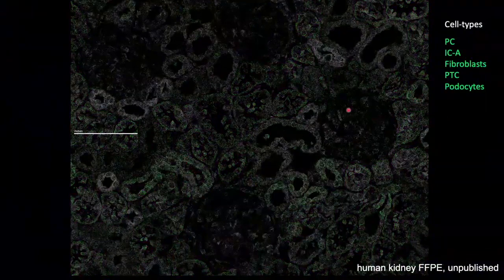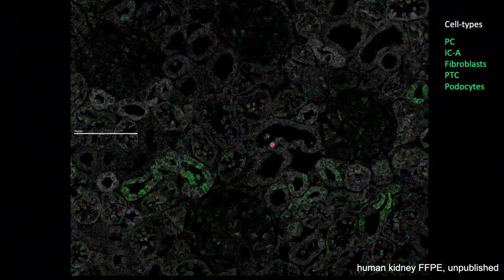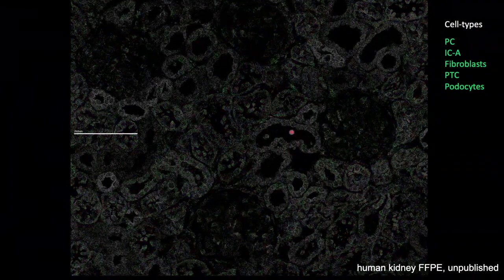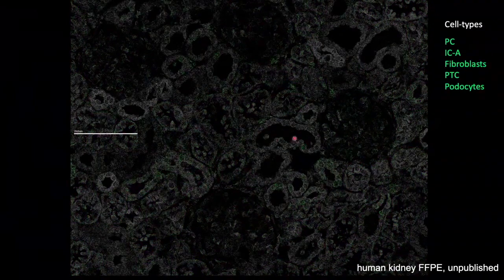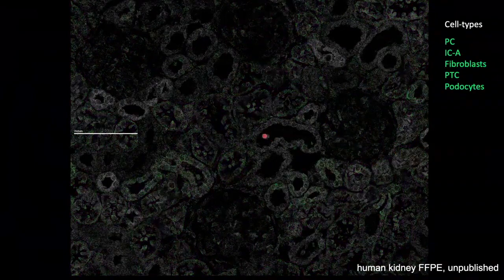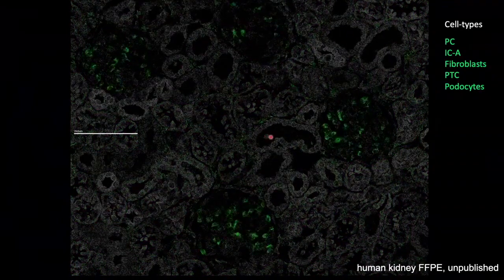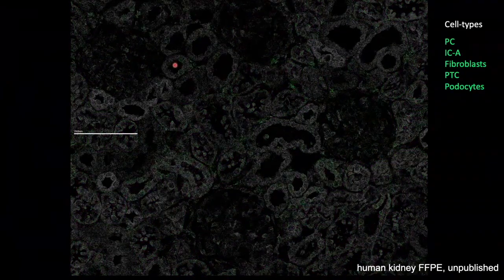You see another view of the different cell types we are able to decode in human FFPE tissue sections. Even this here is a tubule. In this area, there's usually urine flowing, right? And there's a single cell here and there. Those are cells that have been, how do you say that, they are lost into the urine, right? A kidney loses cells into the urine, and even from those cells here, we can get some information, which also here is another one, which I find really exciting.